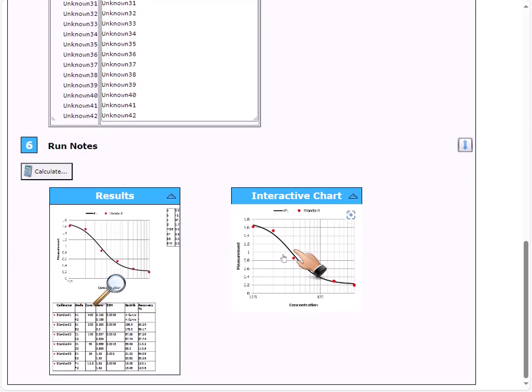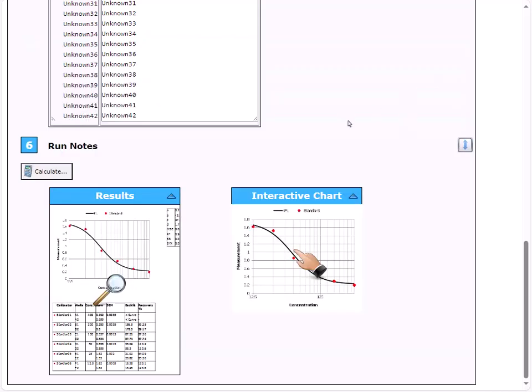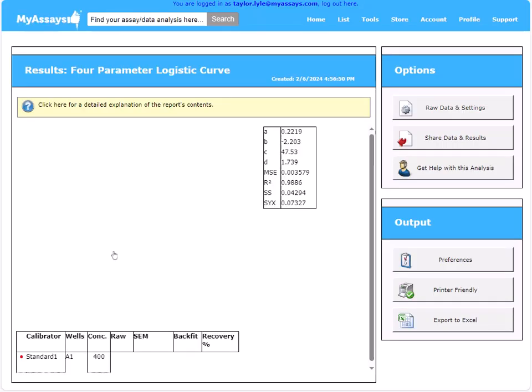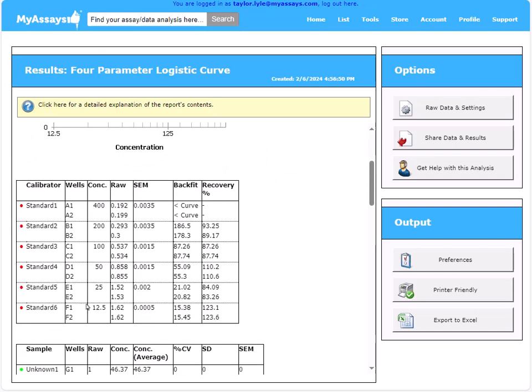We can select the results option to view the full report. At the top, you'll see the curve chart and our curve fitting parameters, including goodness measures. Below this, you'll see the calibrator table, providing additional information about our calibrator samples.